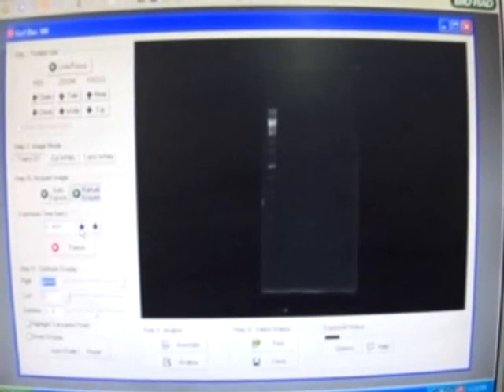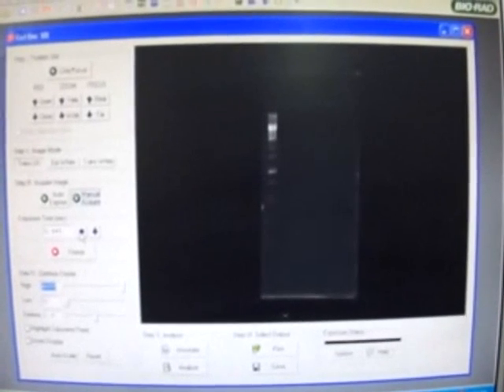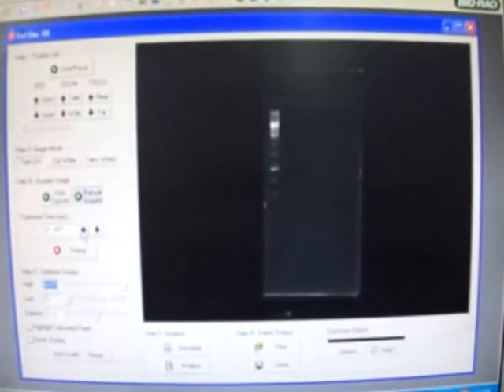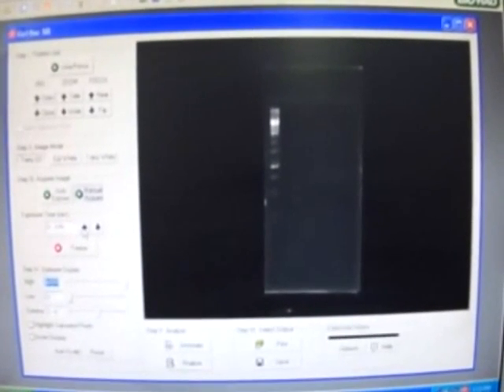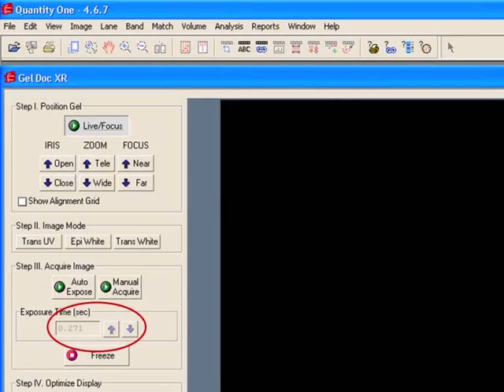In auto exposure, the exposure amount and the time of exposure increases gradually, whereas in manual acquire, the level of exposure time can be manually set to required levels.